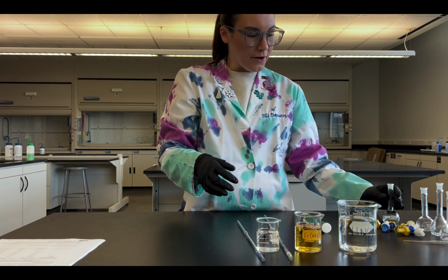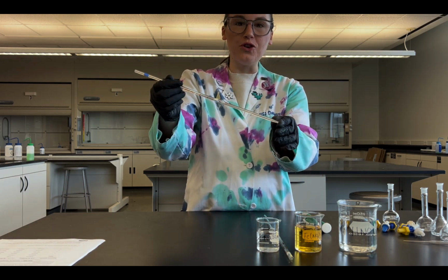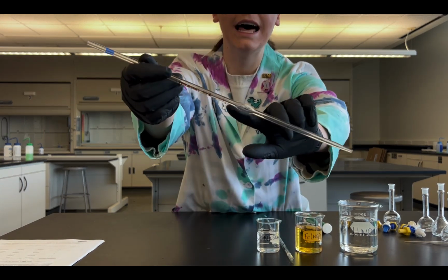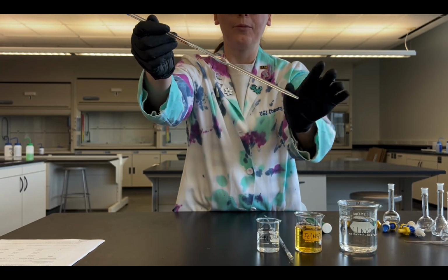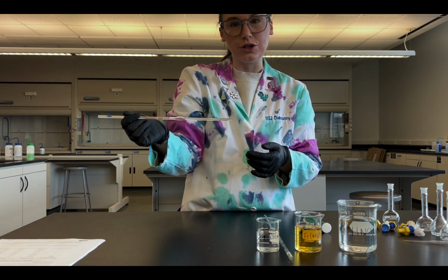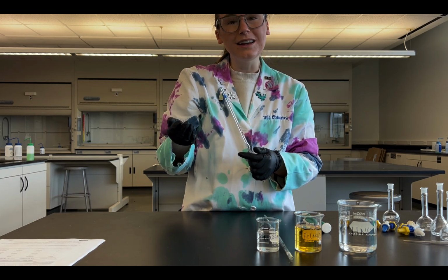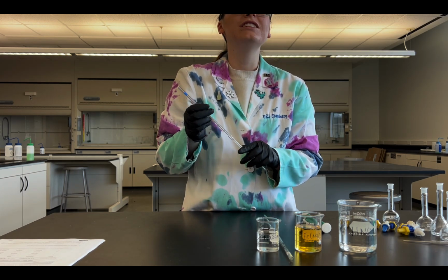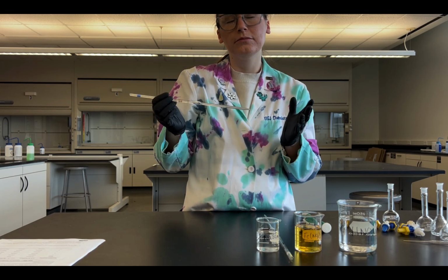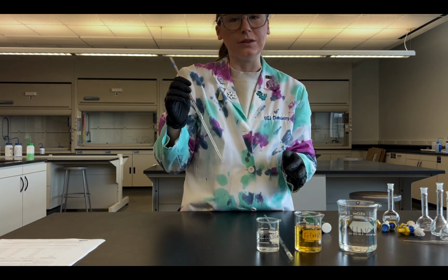Now, in order to get my volumes of thiocyanate and iron correct, I'm going to use a volumetric pipette. This is similar to our volumetric flask where there's a line on the pipette, and when I bring my solution up to that line, I know that I have exactly 1 milliliter of that solution. The reason we want to use these rather than something like a graduated cylinder is because the volumes are so small. It's really hard to tell if I get my meniscus exactly at 1 milliliter in a 10 milliliter graduated cylinder. So these are just easier, plus the delivery method is really simple.